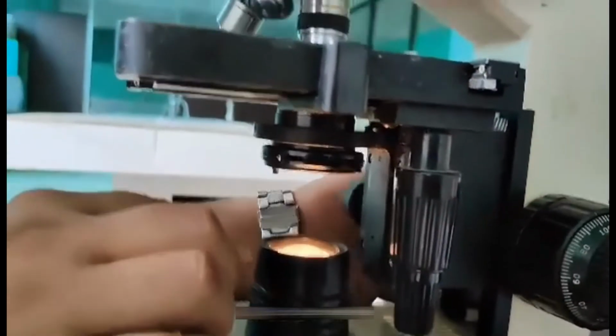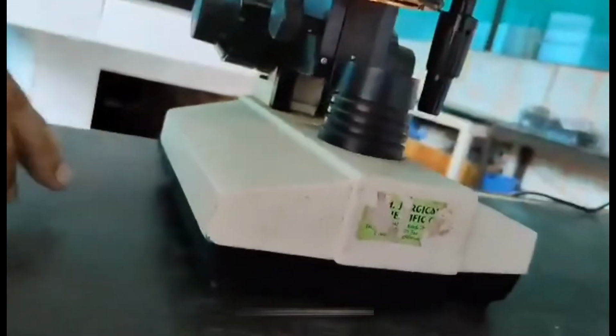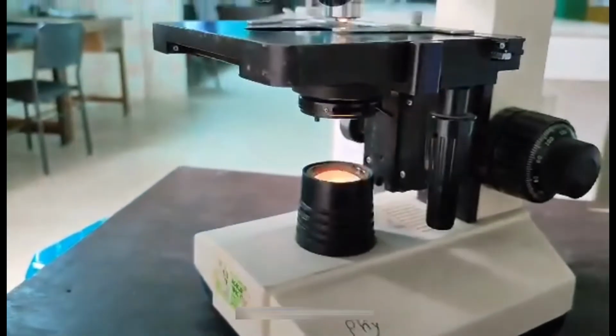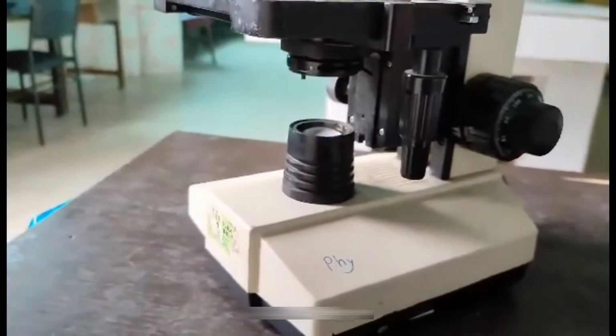From the diaphragm, the light is passing to the slide, and on the left side, this is the light source. You can turn the light source on and off. Okay. So thanks all.